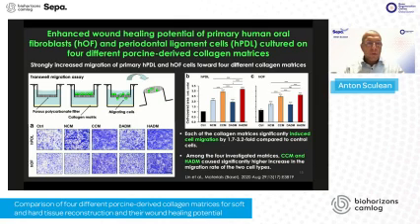So please look at these stainings, these dark blue stainings at the left bottom corner. We have the control, and then we have these dark blue stainings. The darker the staining is, the higher the number of cells, the density of cells, indicating that the cells love these surfaces.